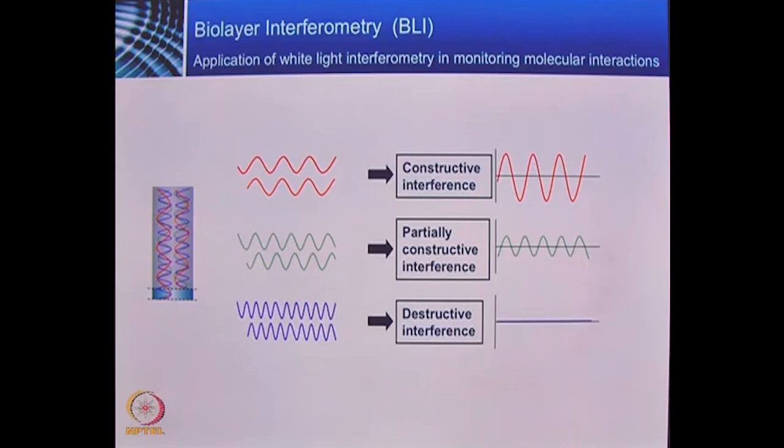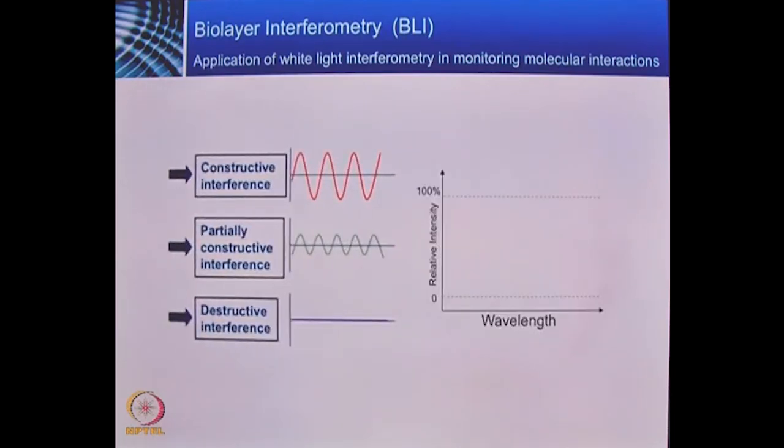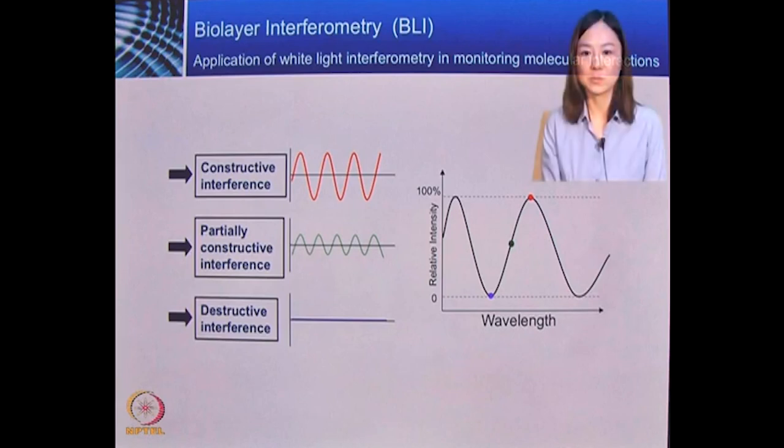No matter what, the system will monitor the two reflected beams and plot the composite of the two wavelengths on this XY plot. Then by plotting the wave pattern of these different waves on this XY plot, we can get an original wave pattern.